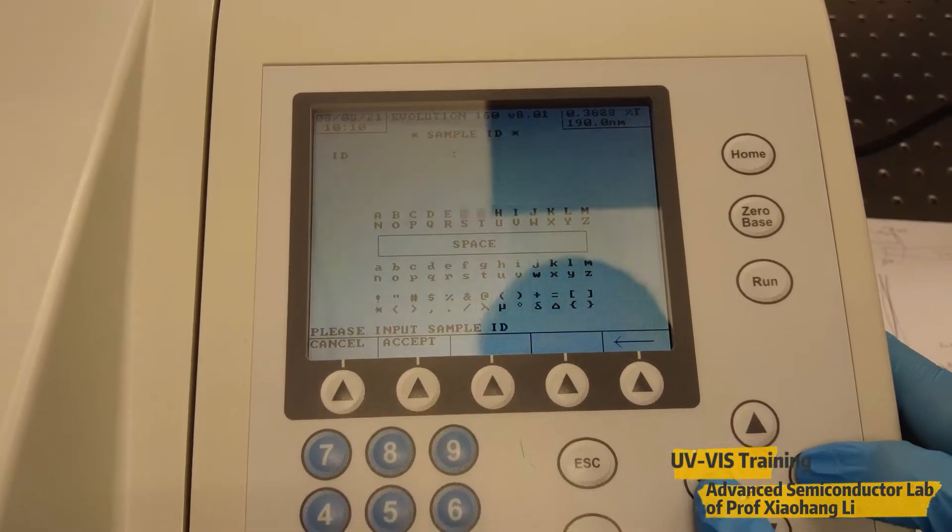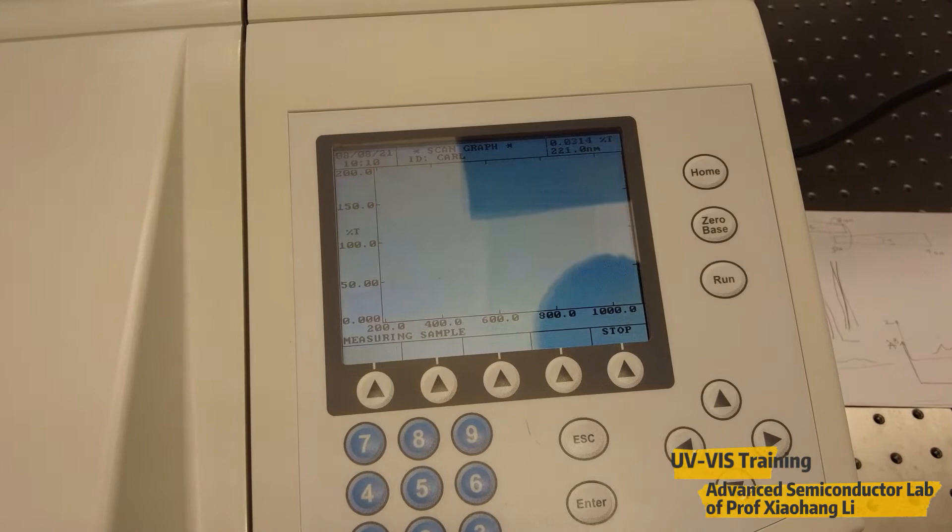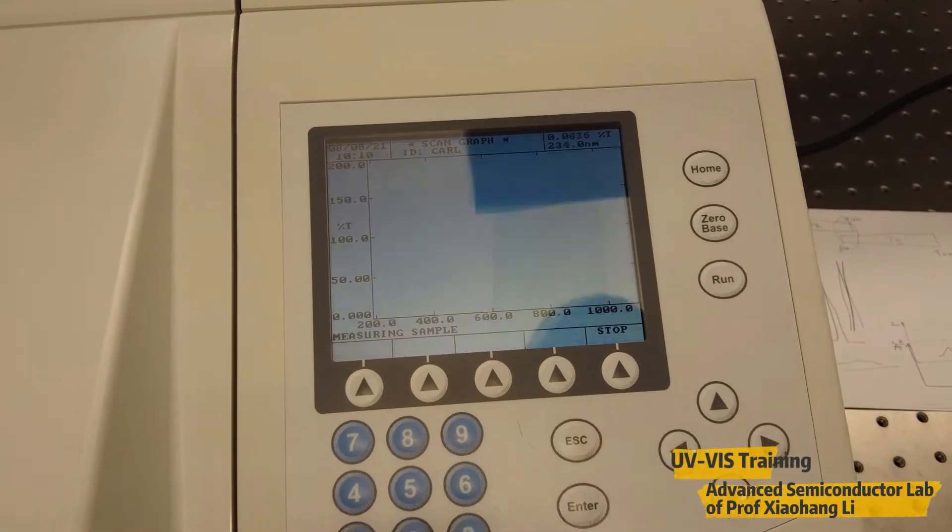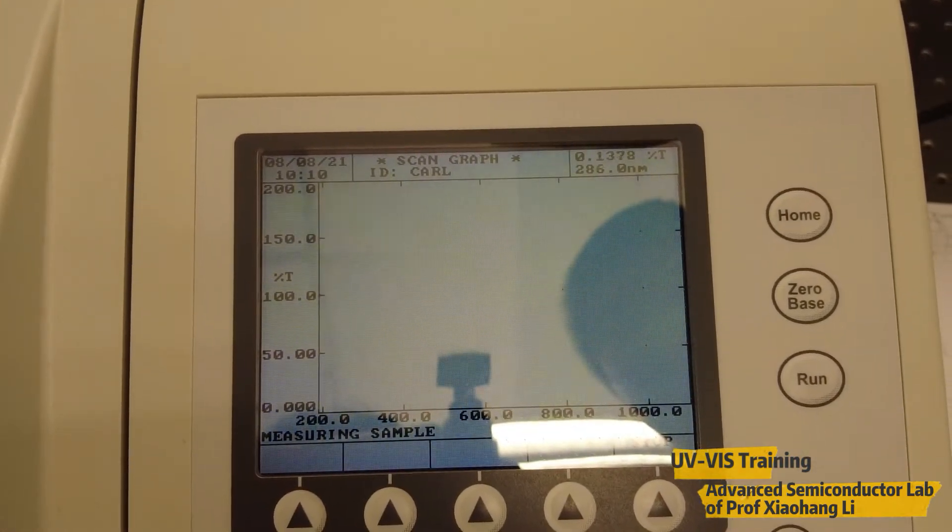We'll give a name. Here we give it as gallium nitride. Then we'll accept. During the measurement it will show the real-time curve. Here it starts to change the wavelength of the incident light.